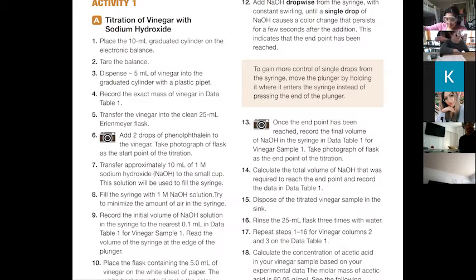So we're going to titrate. This is what we're going to be titrating it with. This is kind of dangerous stuff. So you want to put about 10 mils of the sodium hydroxide into a cup. Well, I don't plan on splashing it on myself. All right, so what you're going to do, Raj, is take the syringe and pull it up to 10.